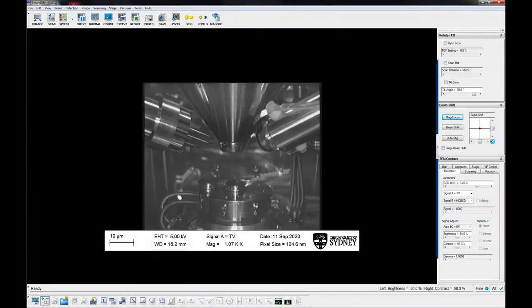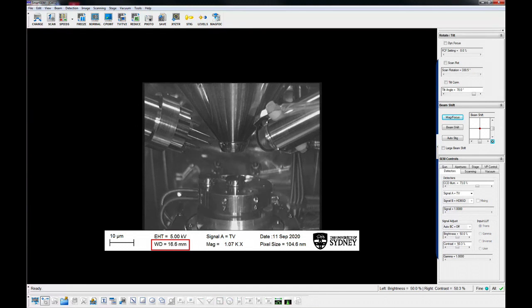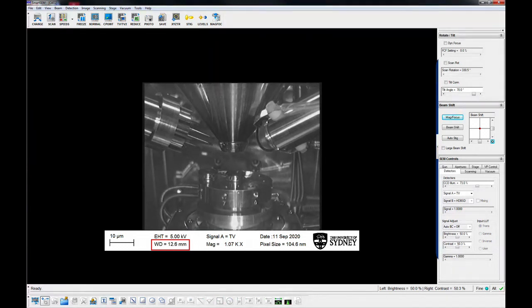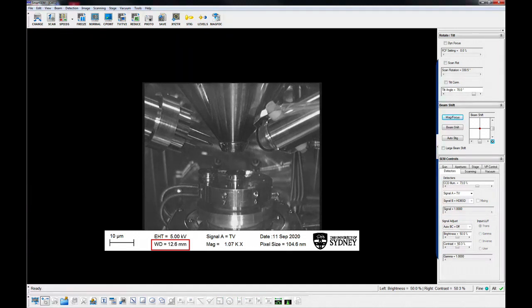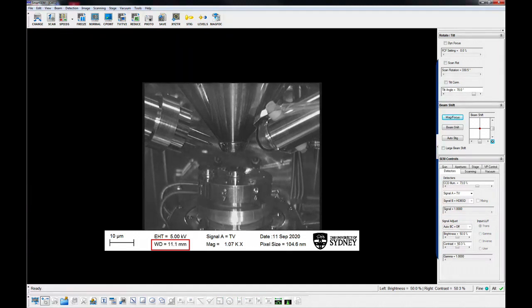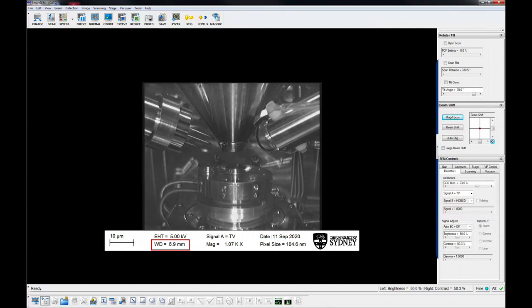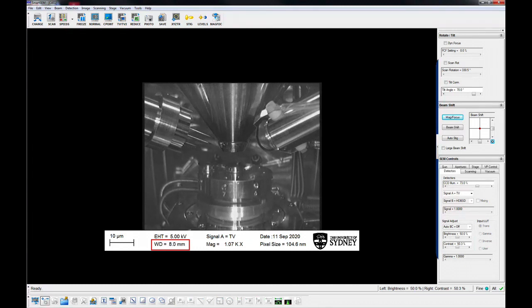Move the specimen to the desired working distance. Always watch the chamber scope when bringing the sample to a shorter working distance, and make sure track Z has been checked on the stage navigation window. Do not move the specimen closer than three millimeters.